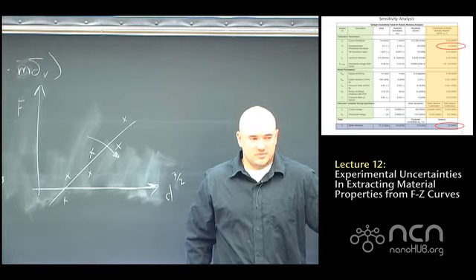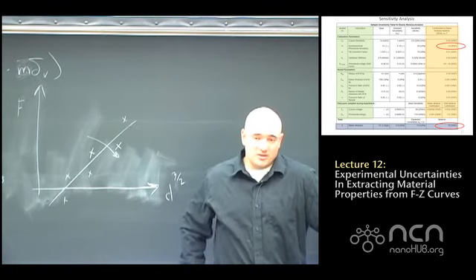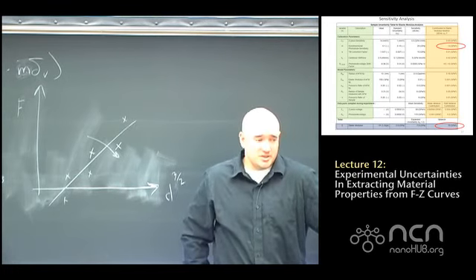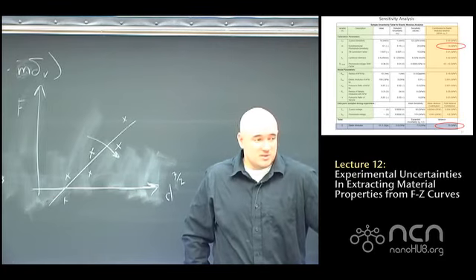This is a situation that's unique when you're talking about a nanometer or less of indentation. If you start talking about larger indentations, for example, an experiment on cells where maybe it's 500 nanometers of indentation, it's not such a huge issue. It's kind of unique to the case study that I've done.